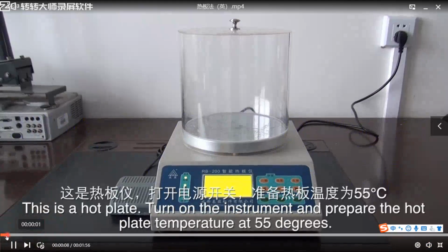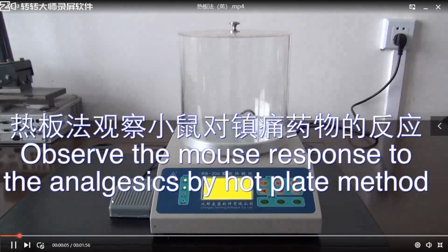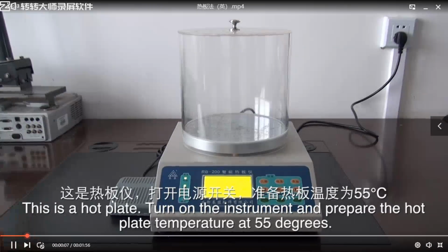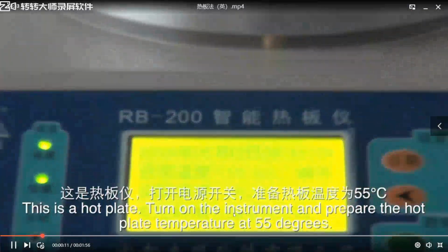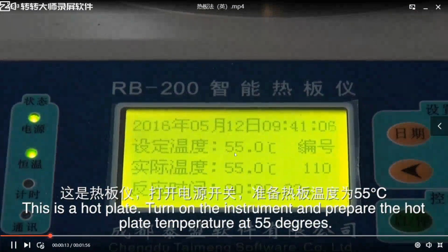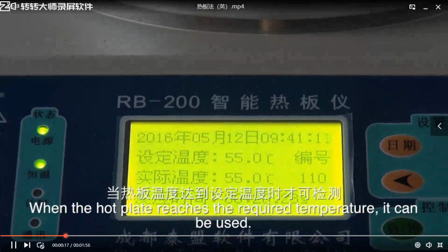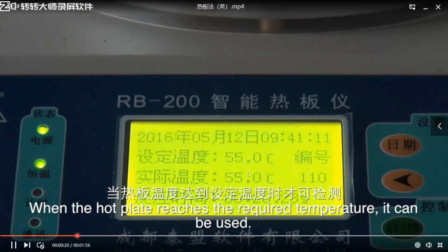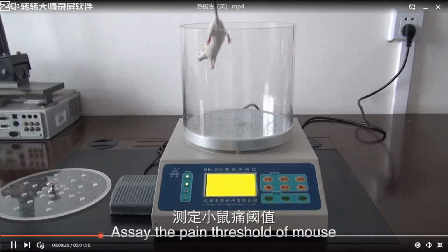This is how a mouse responds to analgesics in the hot plate method. This is a hot plate. Turn on the instrument and prepare the hot plate temperature at 55 degrees. When the hot plate reaches the required temperature, it can be used. Now let's see the pain threshold of a mouse.